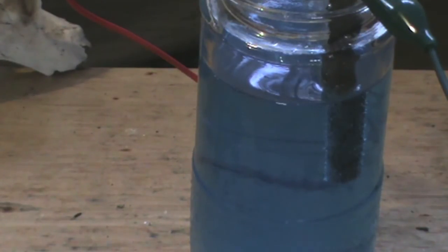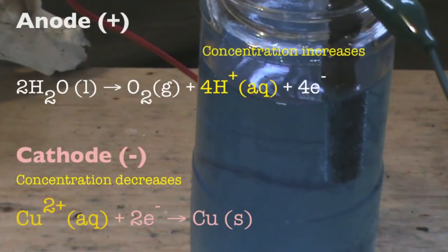As we extend the duration of the electrolysis, the concentration of hydronium ions increases at the anode. And at the same time, the concentration of copper 2+ ions decreases at the cathode as it is reduced to copper metal.